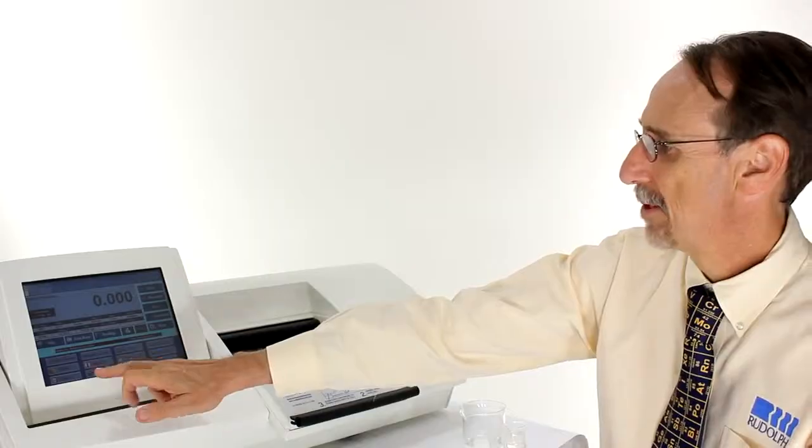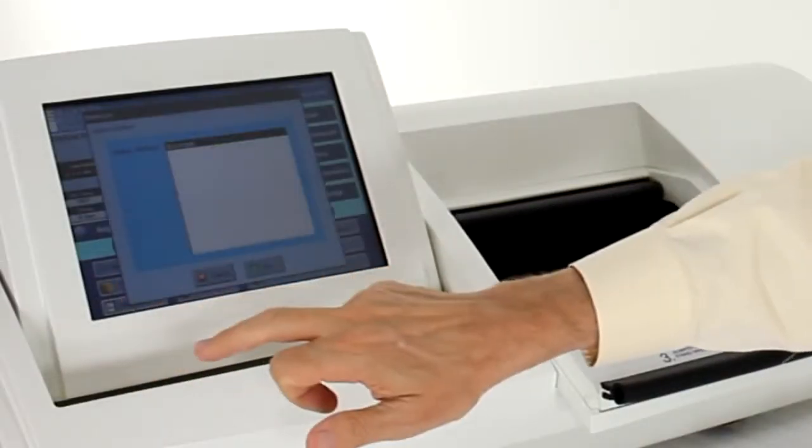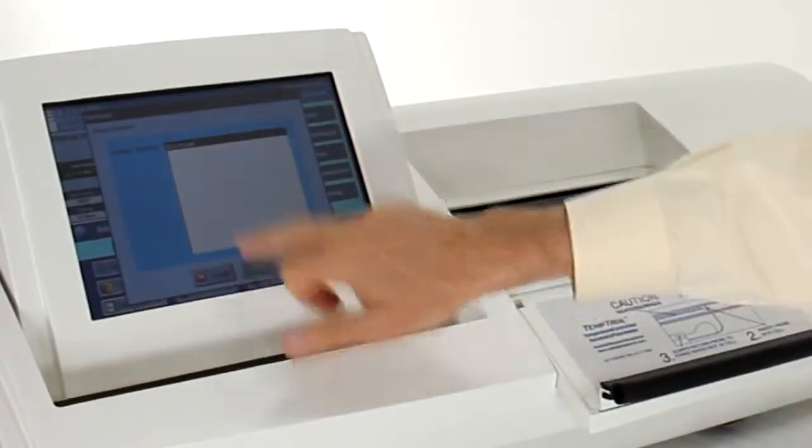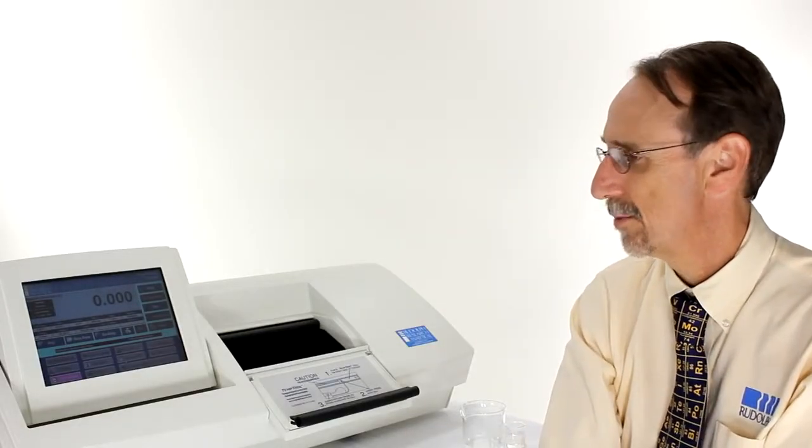With the Polarimeter, the first step is select the method. Press methods, select the method, press set. In this case I'm measuring sucrose so I've selected the sucrose method.